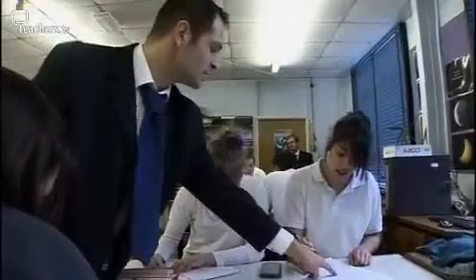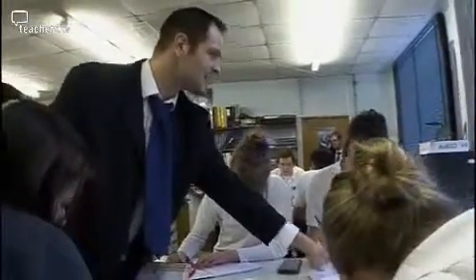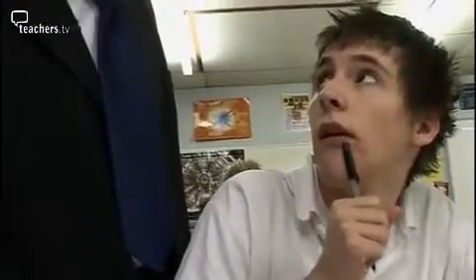So the acidity drops a little. When you get to this point here, you've virtually got very few H pluses left. What can you say then at this point about the number of OHs and the number of H pluses at pH 7? They are both the same number. Brilliant, well done. Absolutely right.